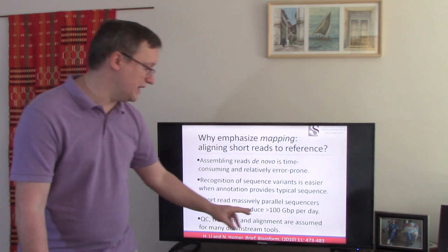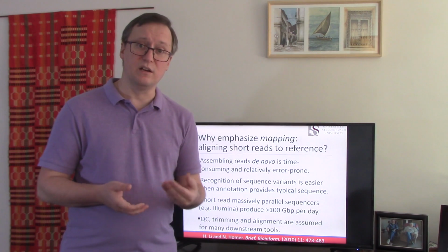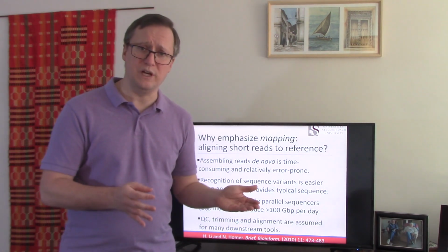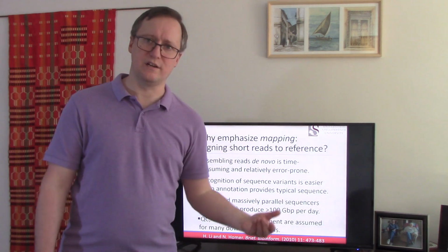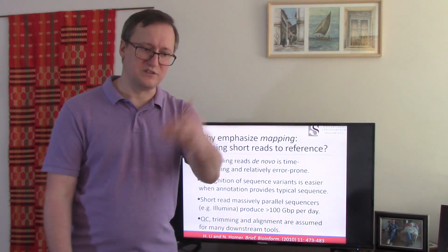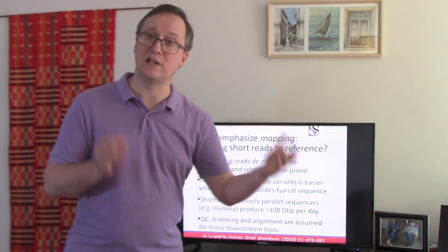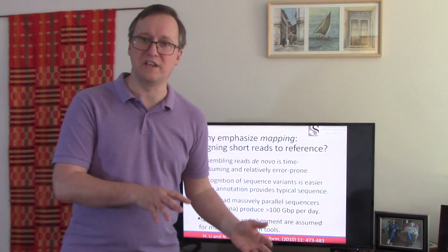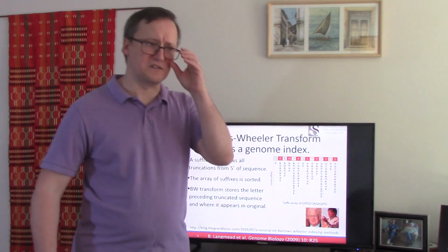Quality control, trimming, and alignment processes are really commonly expected for all of the systems we use downstream to turn our data into information. So if you haven't done a mapping of your reads to the reference, it's very difficult then to move on to do a lot of the advanced sequence analytics that we'd like to do. So mapping has become very popular for all of those reasons.